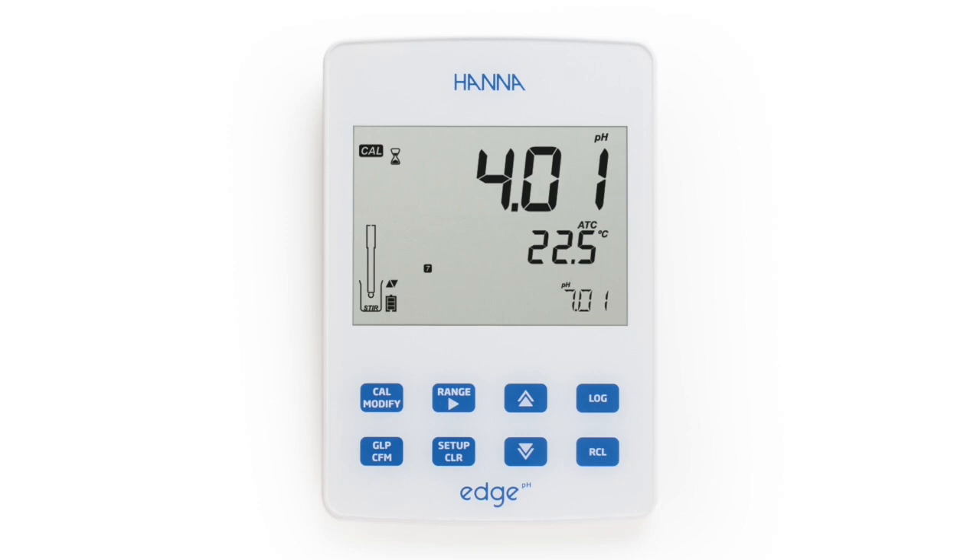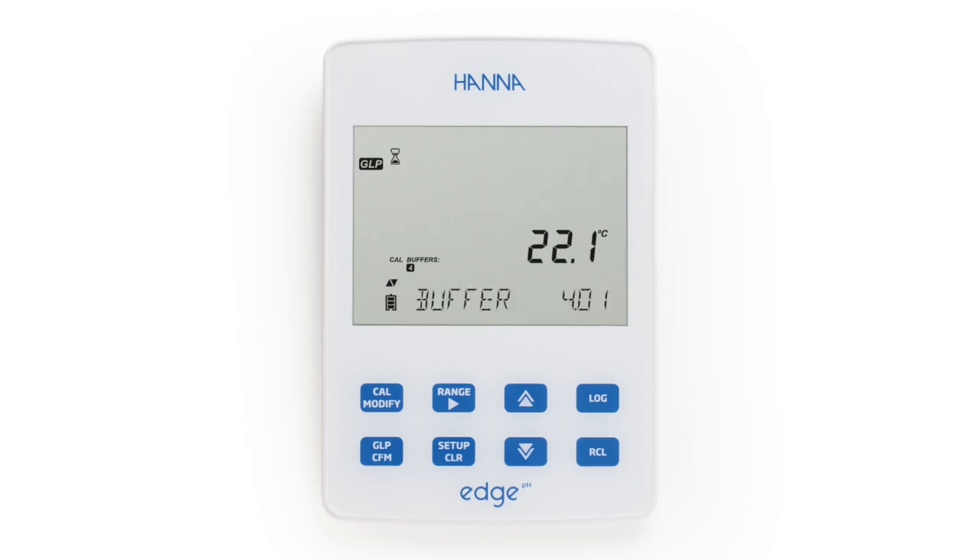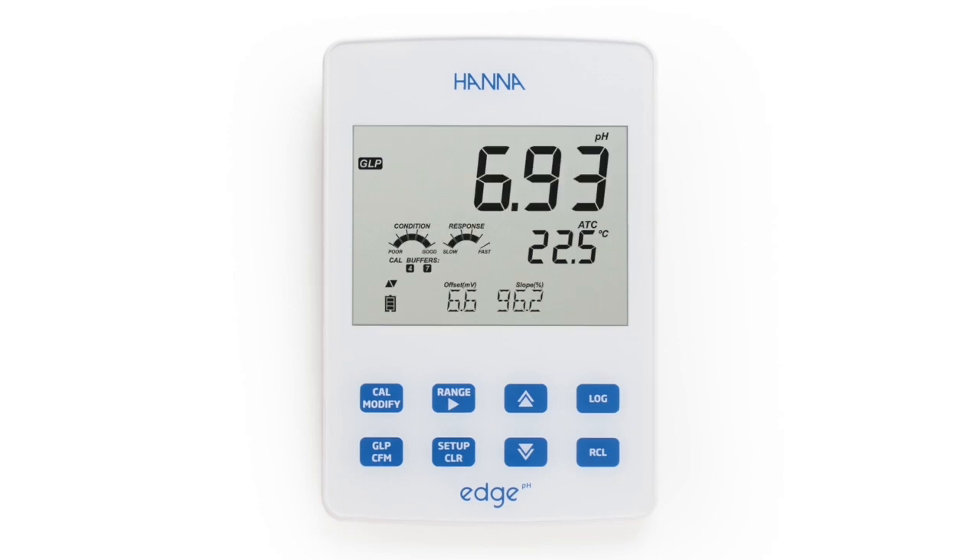Calibration data is stored on the electrode upon exiting and can be reviewed by pressing the GLP button. The GLP data includes the last calibration date, time, days to expiration when calibration timeout is enabled, calibration points, offset, and slope percentage.